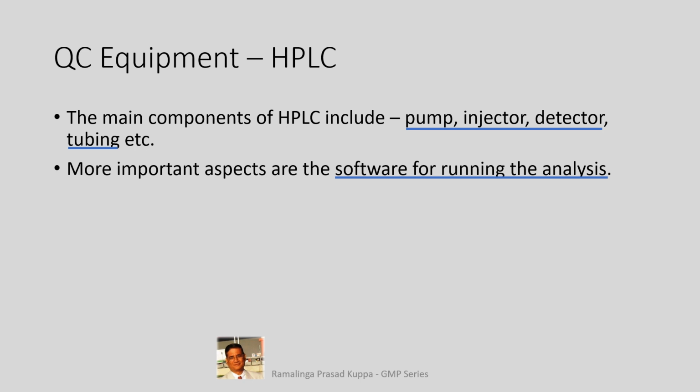This is trail, T-R-A-I-L. Access controls, peak integration types, data capture, all have to be meticulously done in the qualification of the system. That is a different and elaborate subject which has to be discussed separately.